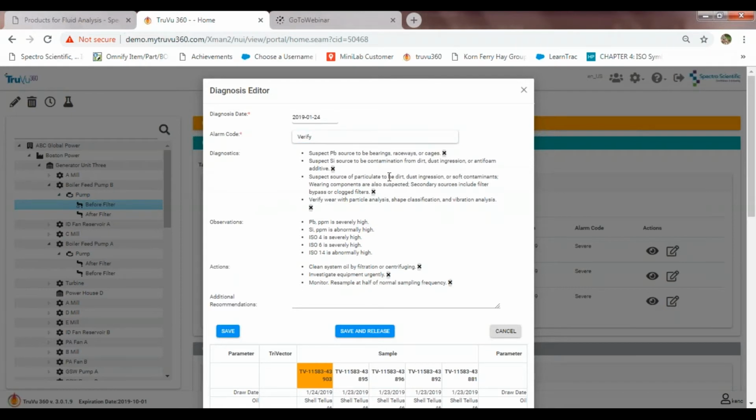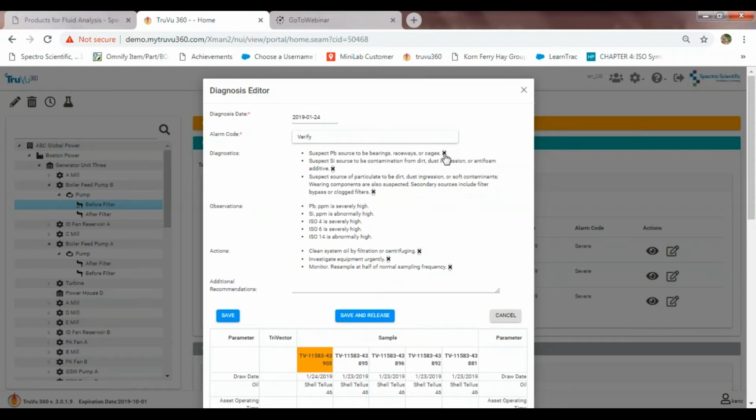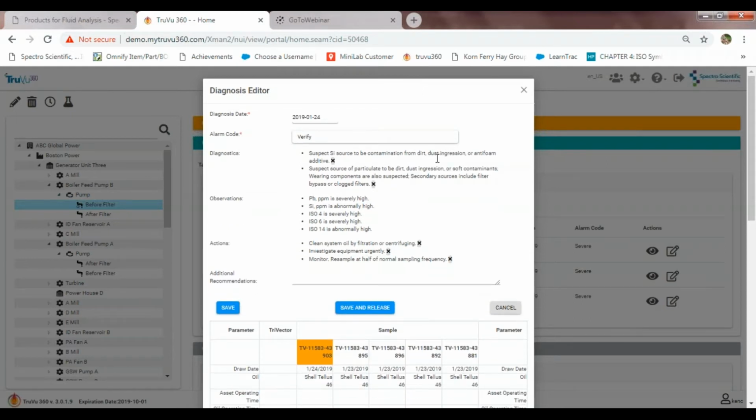But you could delete these individual recommendations. So I just edited that. Observations can't be edited. Why? They're simply telling you that you've exceeded an alarm value, and so if you're thinking you're getting a lot of false highs or false lows, well, readjust your alarm set. But basically, observations are just which parameters exceeded an alarm limit.